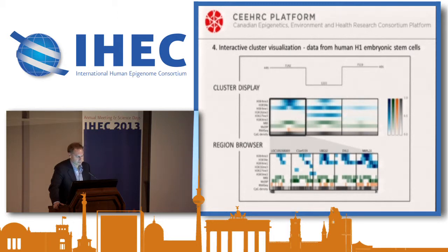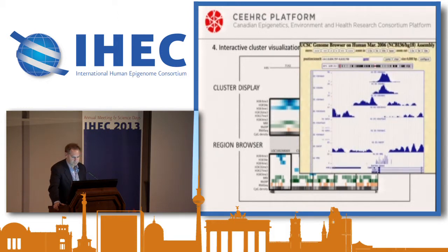And of course, we want to dive down, so the software allows you then to say, well, what are the genes within that cluster? And although there may be a lot, we can still actually go and look at the pattern across any individual gene at that point. And of course, we can then go back and look at what the patterns were, the precise bed files that were for that gene if one wanted to. So it's important to discover the patterns of promoters and then be able to drill down to the actual gene feature that we're looking at.